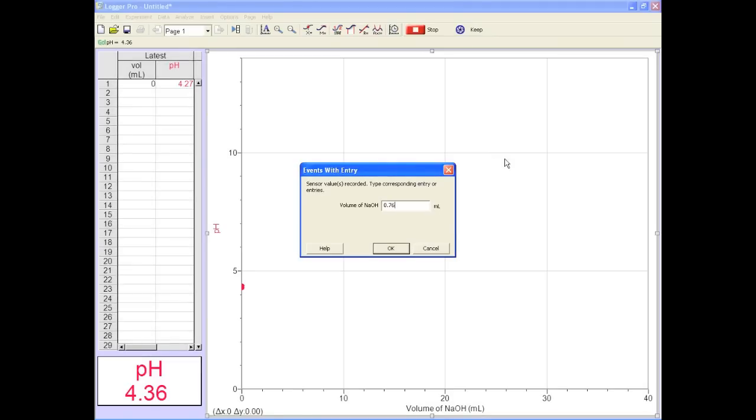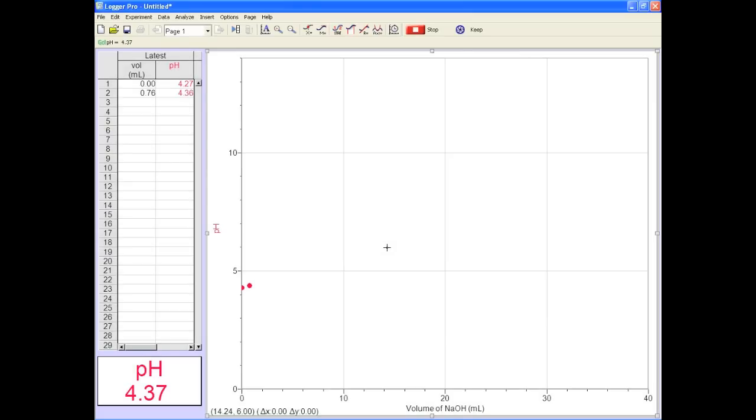Don't slack off on this or you'll just end up having to redo the whole experiment. Oh, and don't press stop either, you're not done yet. You can see 0.75 mils of titrant was added here.